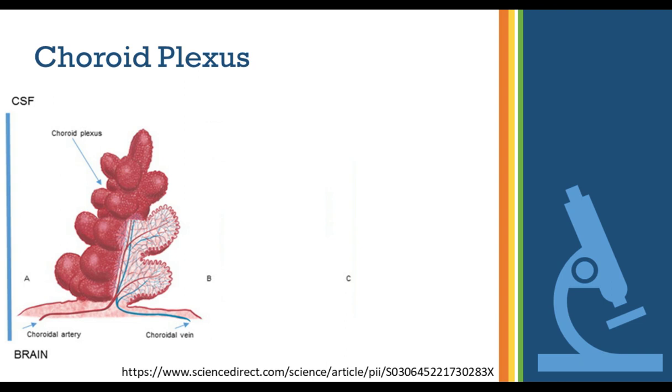Necropsy is basically an animal version of an autopsy. That's when you're dissecting the animal, and it's a very, I'd say, dirty environment. While we do wear PPE and we are protected, we have a dedicated suite for the necropsy of the primates. You have multiple pathologists and vets in there pulling out different tissues for different testing types, and it's possible to get fecal matter from one area of the body up into the choroid plexus when you're trying to pull it out of the brain. So it's very easy to become contaminated with bacteria.